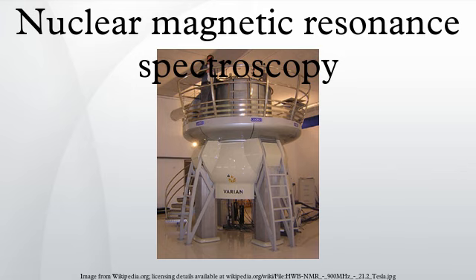Basic NMR techniques. When placed in a magnetic field, NMR-active nuclei absorb electromagnetic radiation at a frequency characteristic of the isotope. The resonant frequency, energy of the absorption, and the intensity of the signal are proportional to the strength of the magnetic field. For example, in a 21 Tesla magnetic field, protons resonate at 900 MHz. It is common to refer to a 21T magnet as a 900 MHz magnet, although different nuclei resonate at a different frequency at this field strength in proportion to their nuclear magnetic moments.